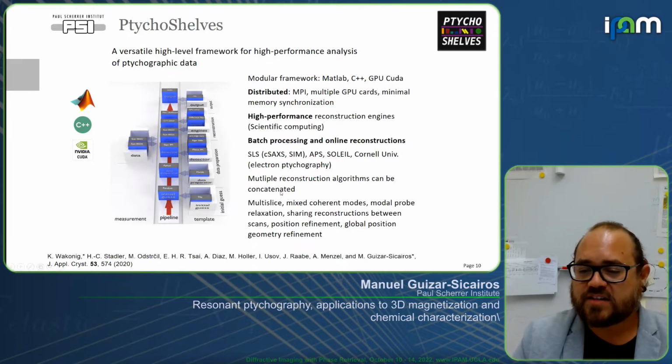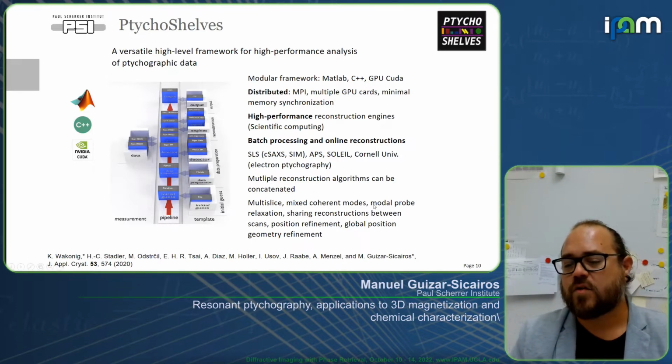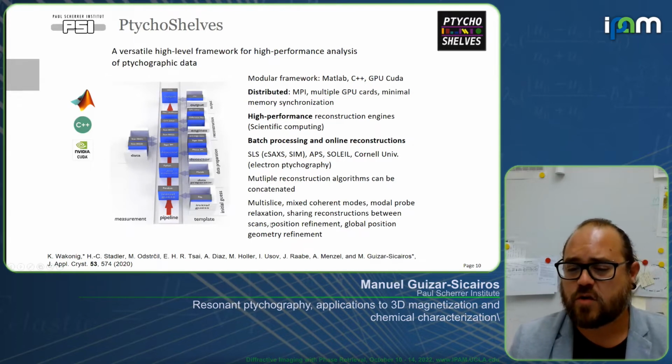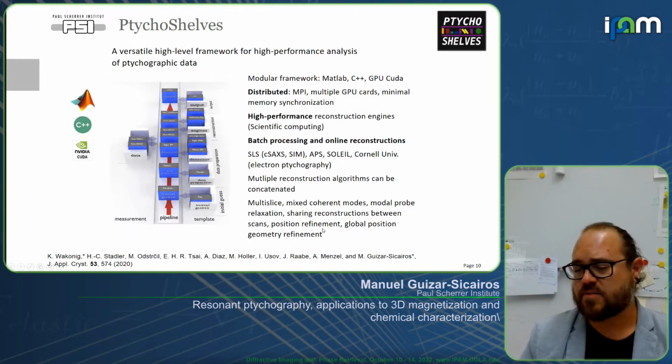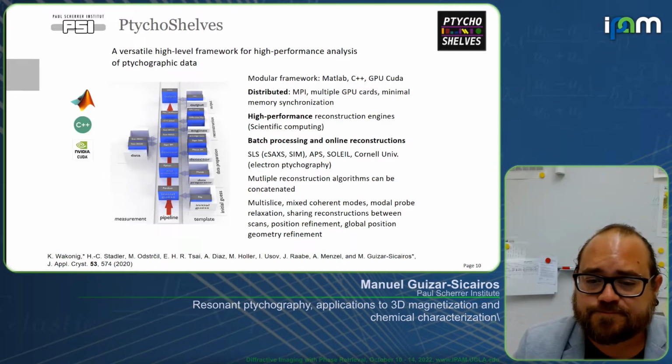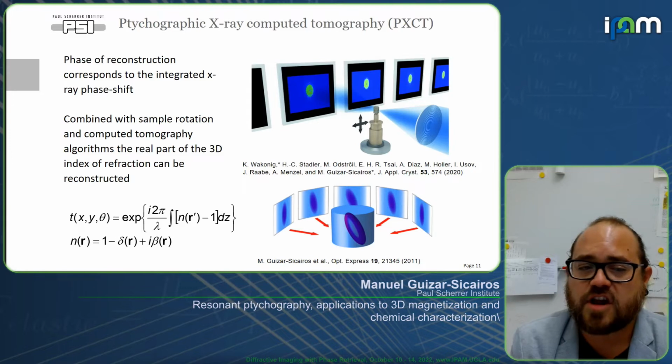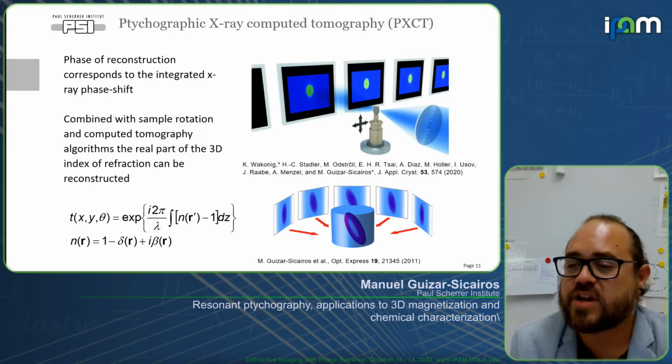You can concatenate different algorithms, and they have all of the different types of reconstructions for ptychography that have been out there.